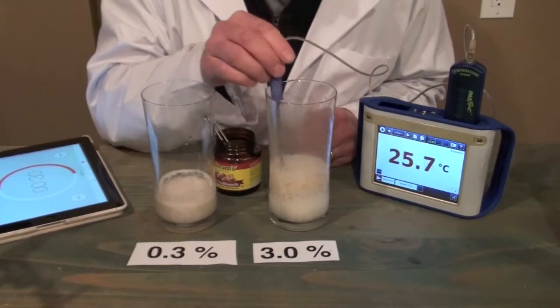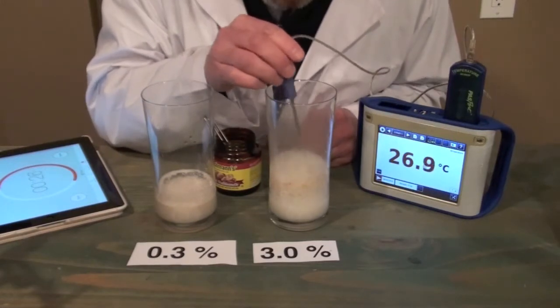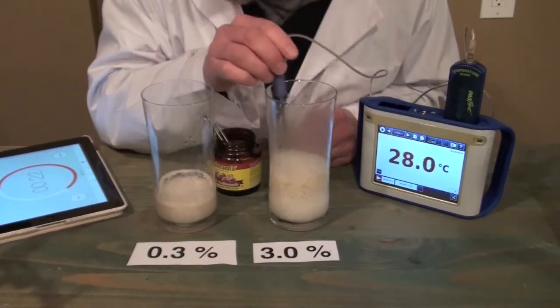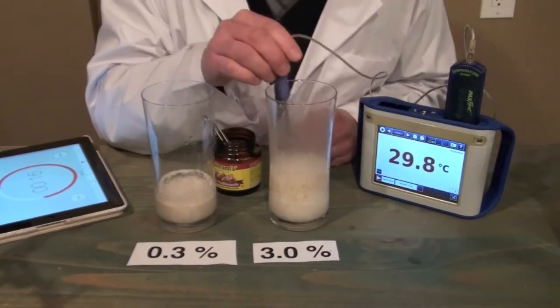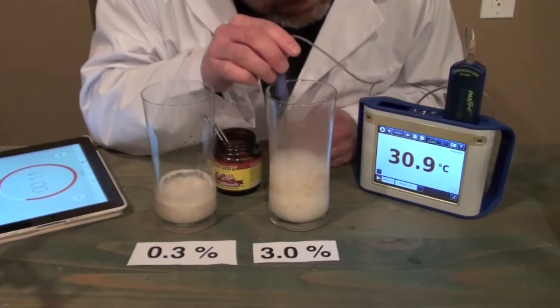If we look at our temperature gauge, we can see that the temperature is rising very rapidly. And we've probably got about 4 centimeters of bubbling in our container. Okay, with 10 seconds left, we see that temperature still rising considerably.